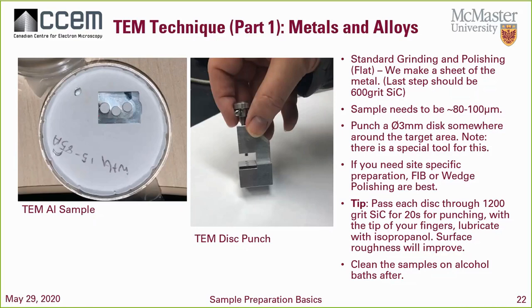Your preparation has to be almost perfect. Wedge polishing is one of those techniques that a lot of people just consider artwork. So if you're looking for site-specific work, just know there's a lot of work ahead. If you're not willing to spend that little bit of extra money or worry about the timing of it, because wedge polishing might take a very long time, you might have to sacrifice a little bit of quality over quantity or over price, okay?